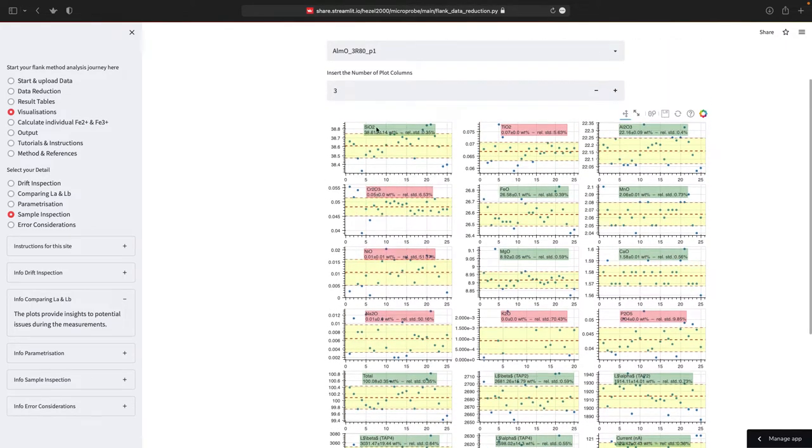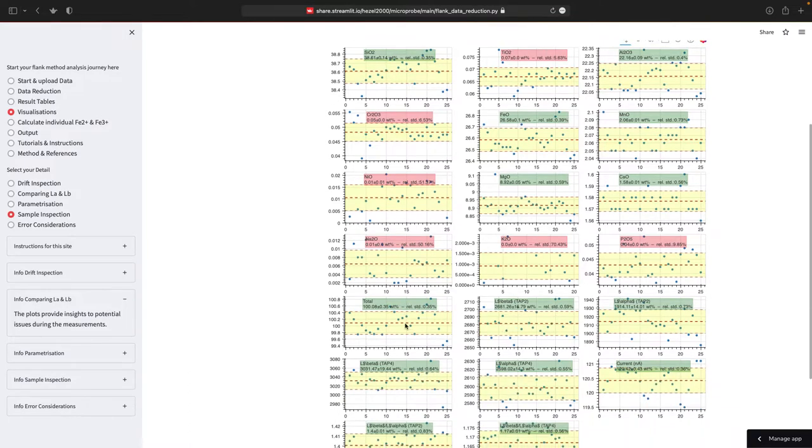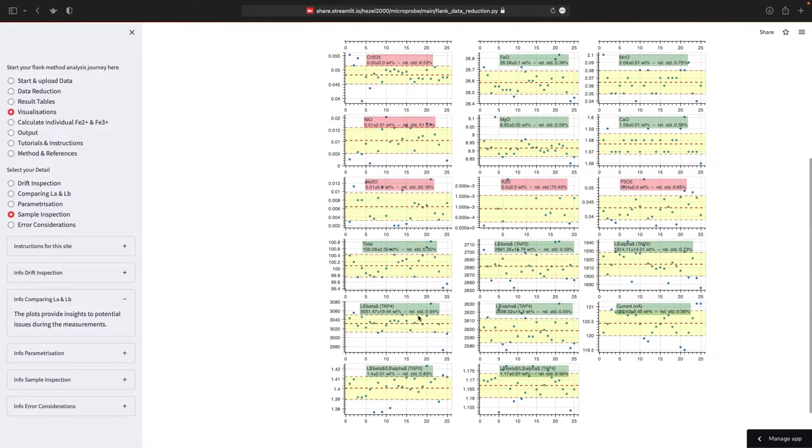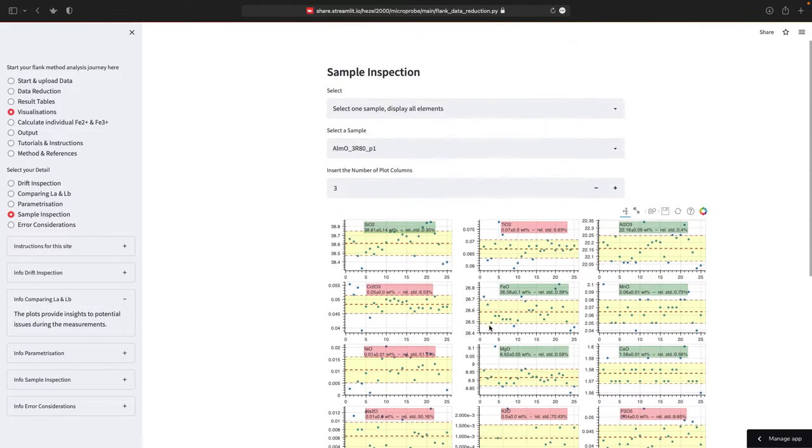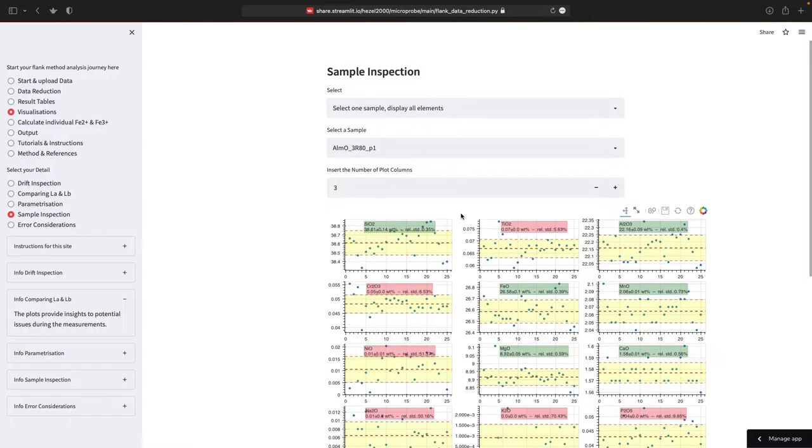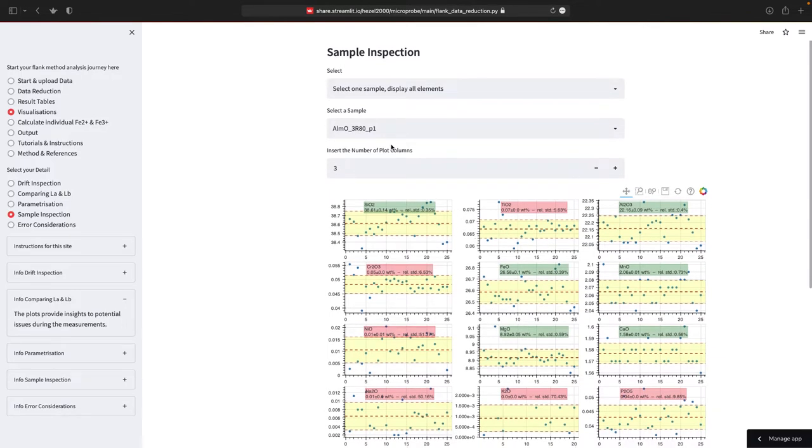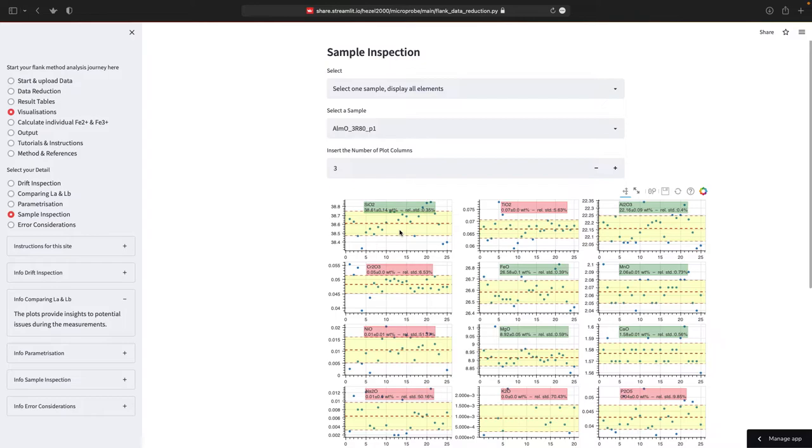And now you see all the elements. So you see chromium, silicon, titanium, potassium, and not only the elements but also the counts of L-beta, the ratio of L-beta divided by L-alpha, the current, and so on. And so you get some impression about your data. And using this tool, you can then in your original file delete or indicate in this inspected column if there's a problem with some of your analysis. You can change this in the original file and then upload it again for analysis.